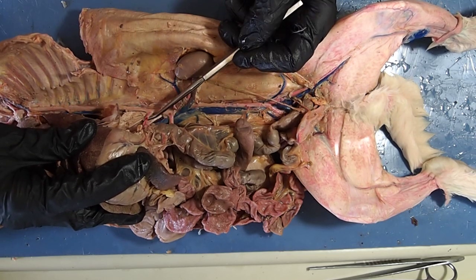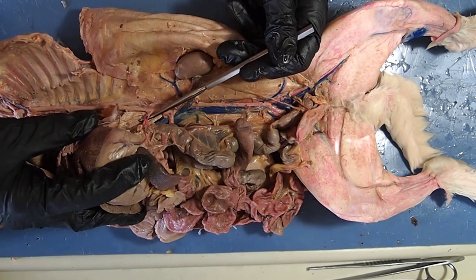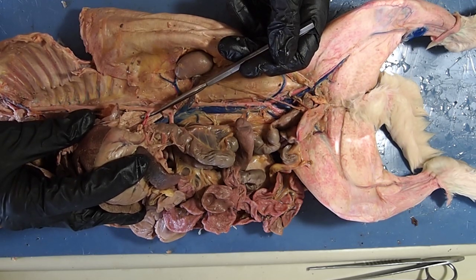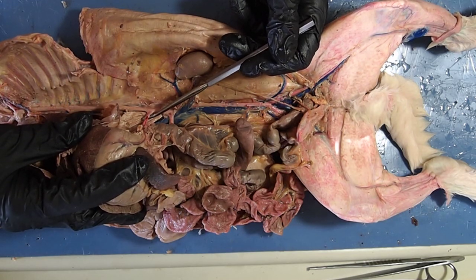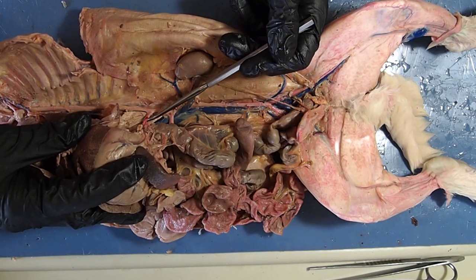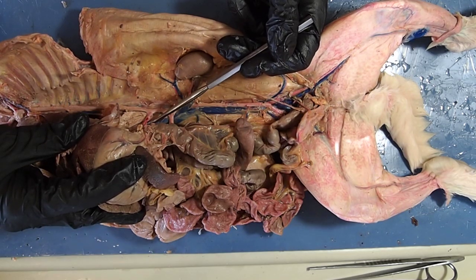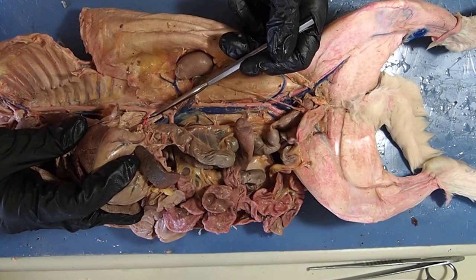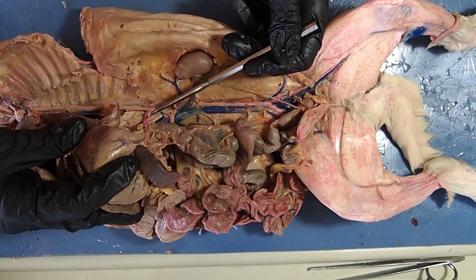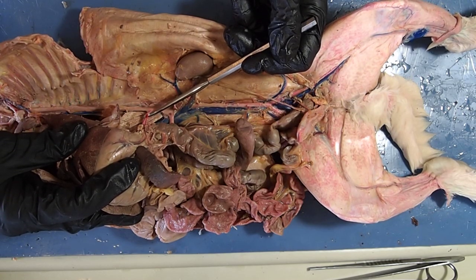This first large blood vessel — and it's red, so remember it's an artery — is called the celiac artery. The celiac artery branches off into multiple branches and supplies your spleen, your stomach, and your liver. That's how those organs get the oxygenated blood that they need, through this first large blood vessel we call the celiac artery.